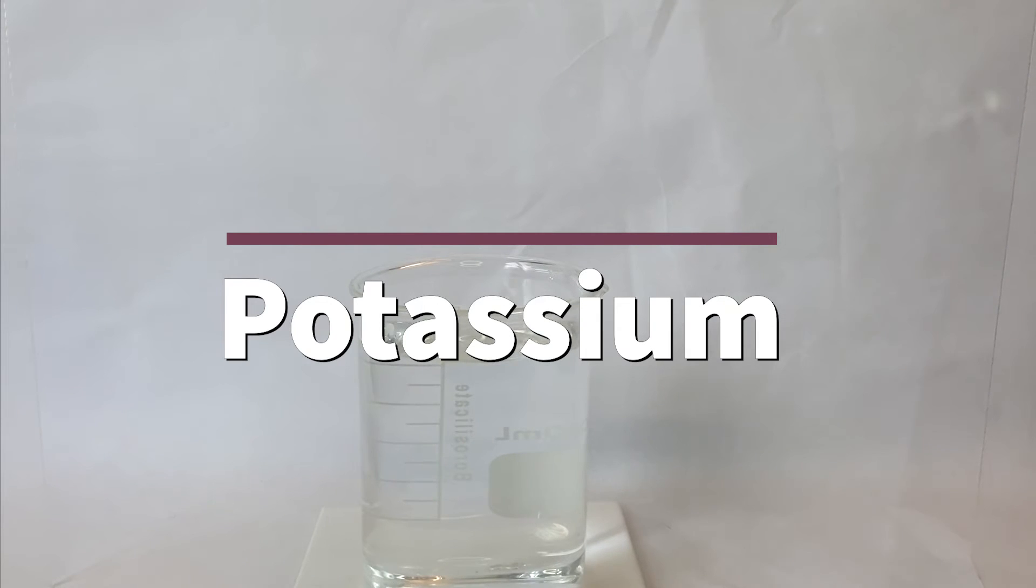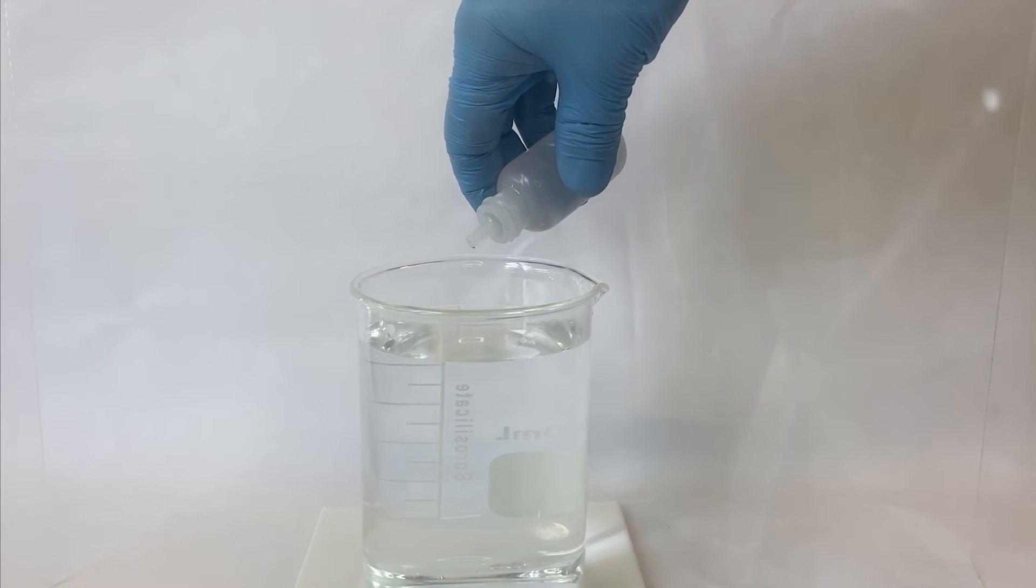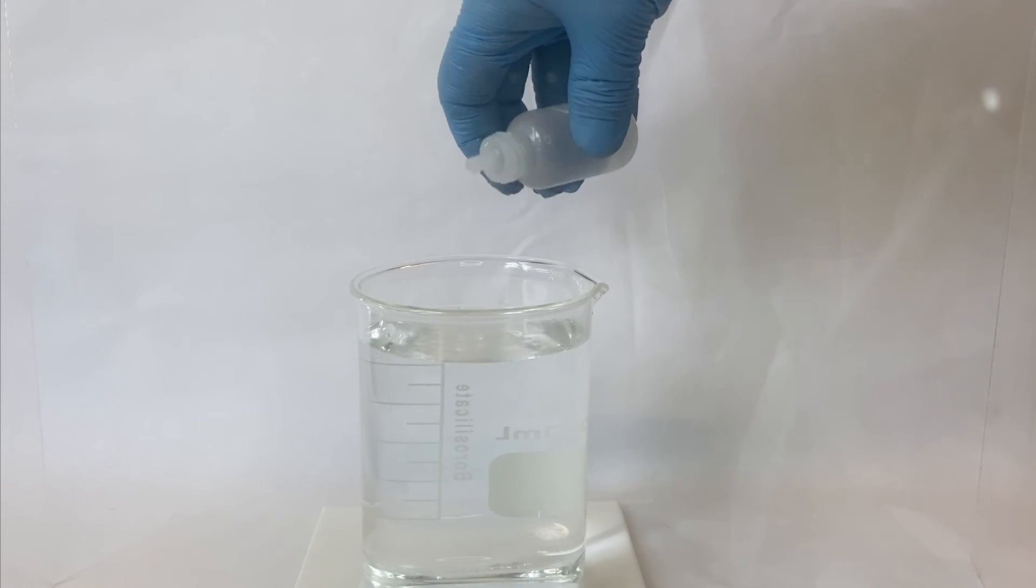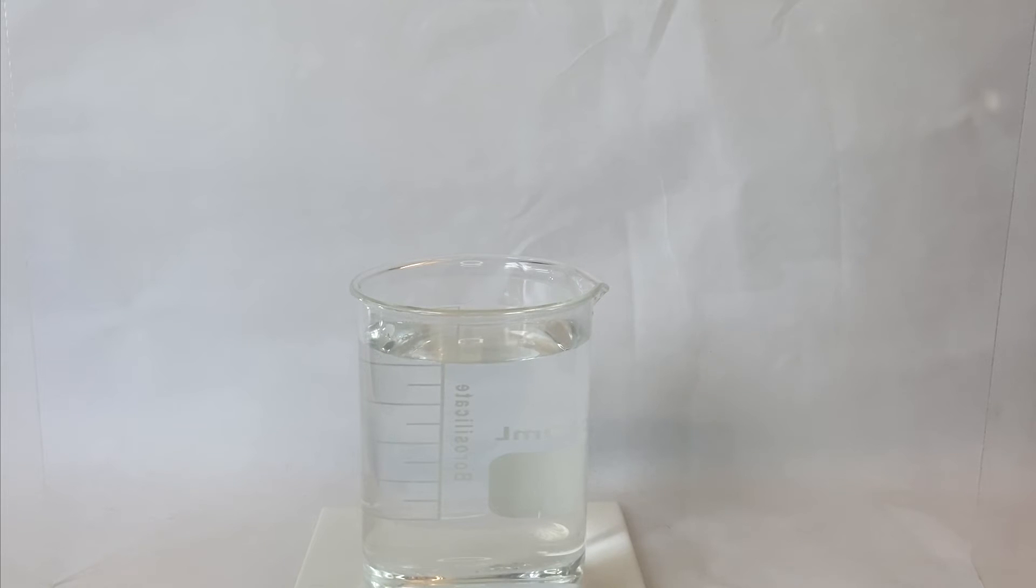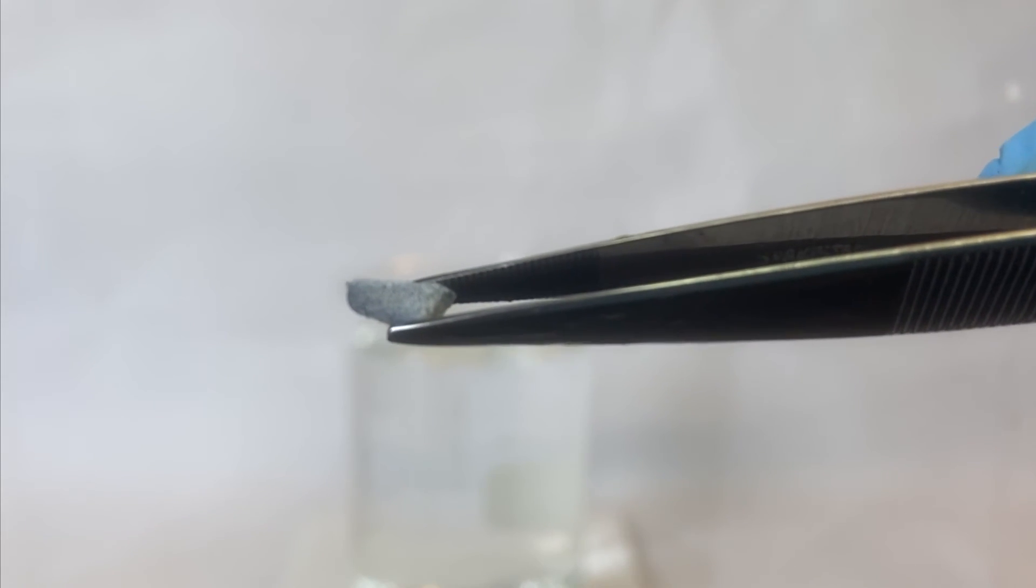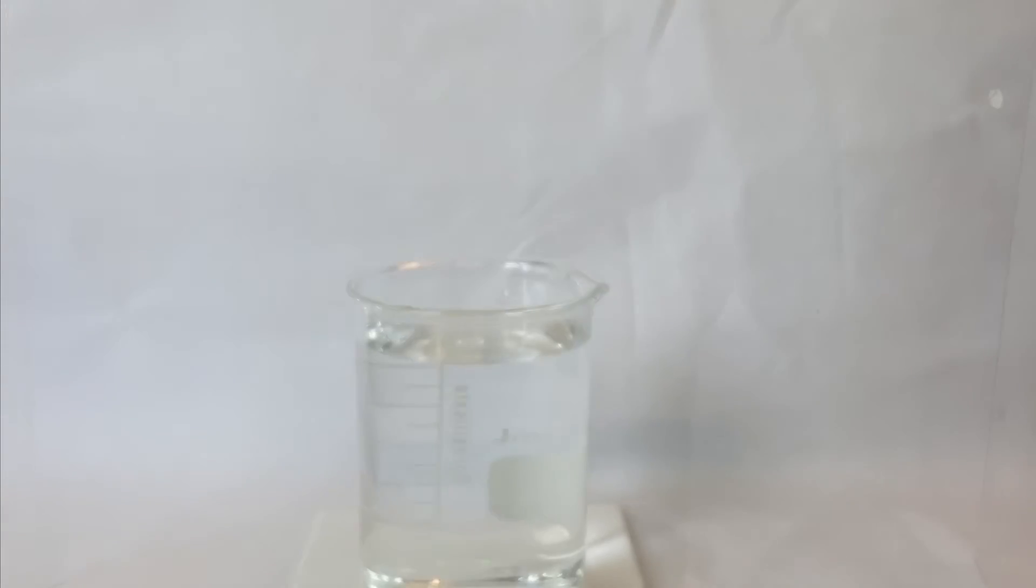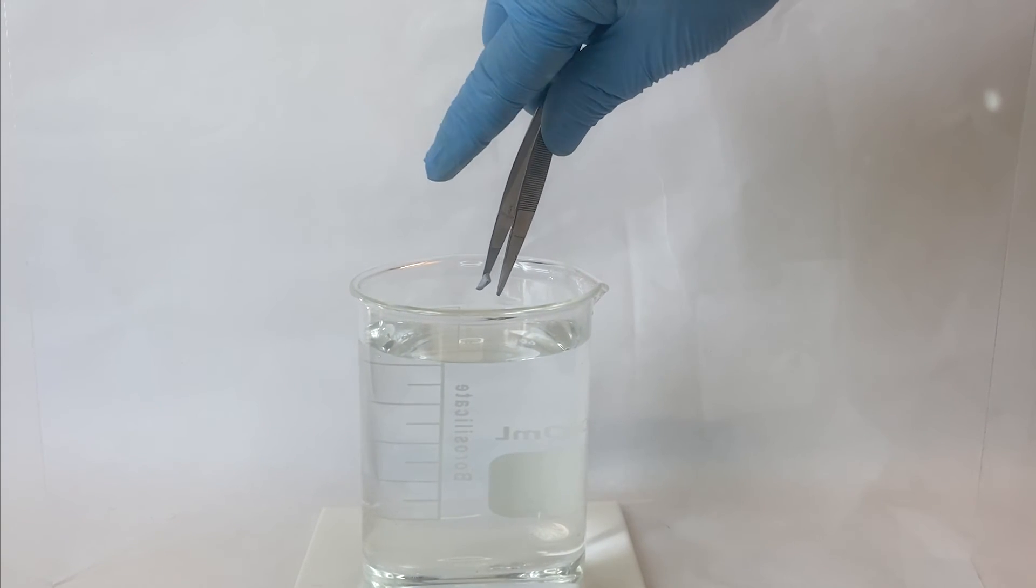The last demo in our first investigation today is potassium. The setup for this demo is the same as the others. I have a beaker of distilled water, and to that I'm going to add a few drops of phenolphthalein. Potassium metal has similar properties to lithium and sodium. And note that I'm trying to use the same size sample for all three of these demos today. Let's add the potassium to the water and see what happens.